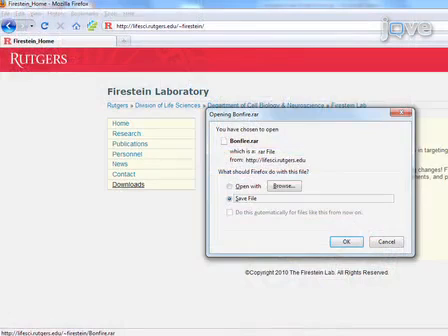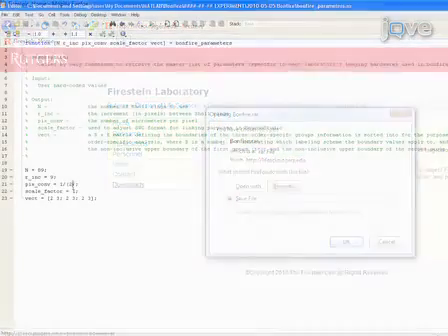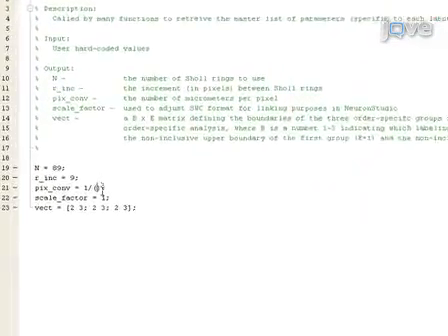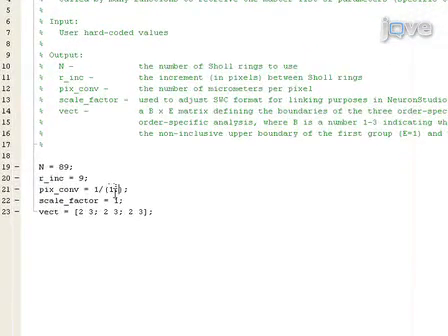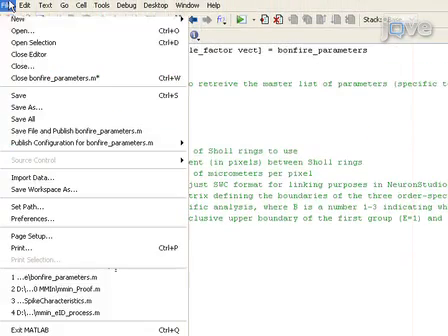After downloading the Bonfire program, the program settings must be adjusted based on the image resolution of your images. In the Bonfire parameters, replace the current value for the variable PIX_conversion with the image resolution value.